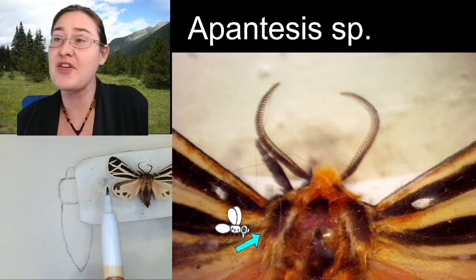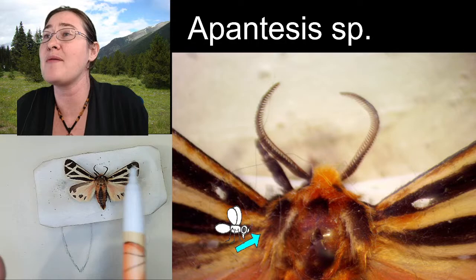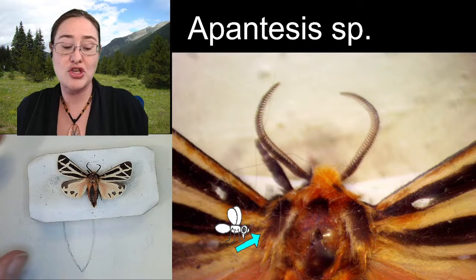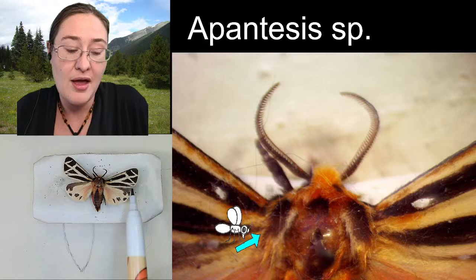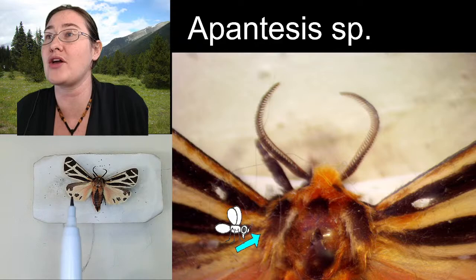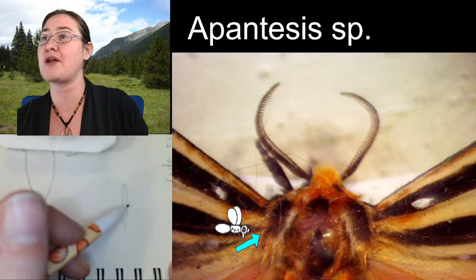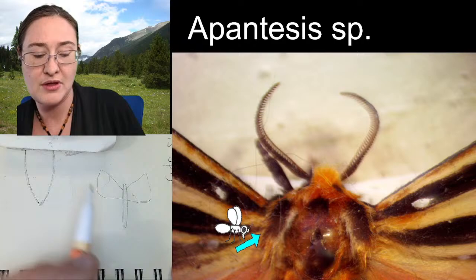Now, this specimen, the right side is pinned better than the left side. I'm probably going to sketch by the right side because when you're looking at a pinned specimen of any type of butterfly or moth, the perfect pin job will leave the back side of the front wings a straight line all the way across. This left wing, I pulled up just a little bit too far. I should have relaxed it down a little bit. So to give you an idea, if you have a butterfly or a moth with a long body, this is the line that I'm talking about.